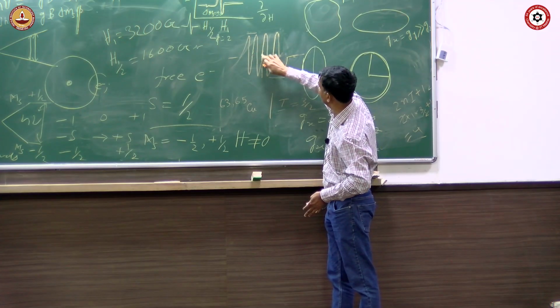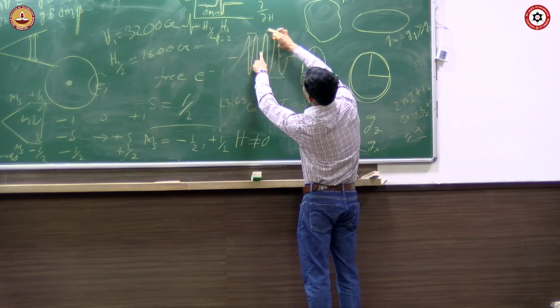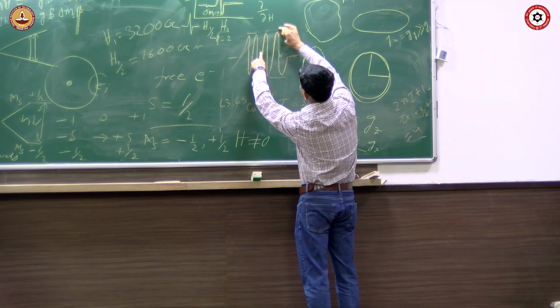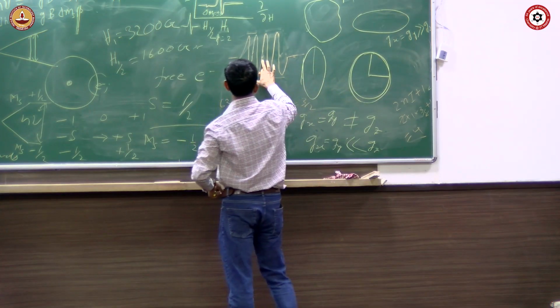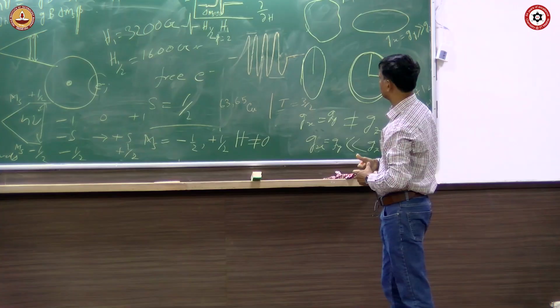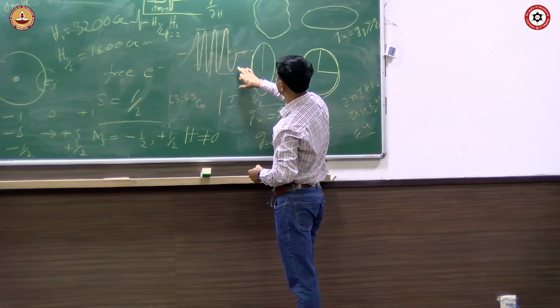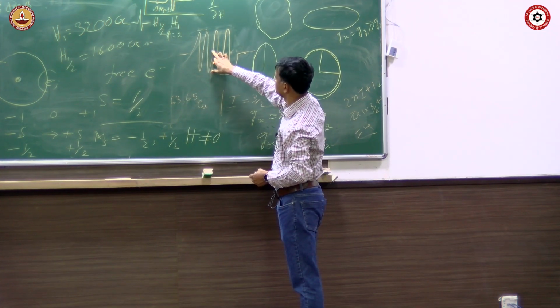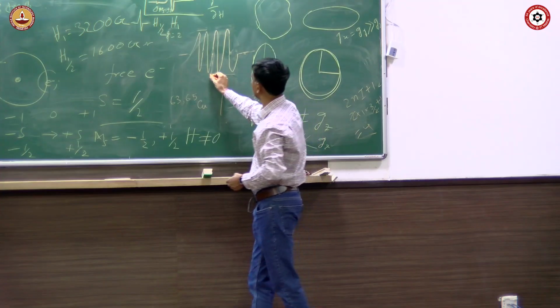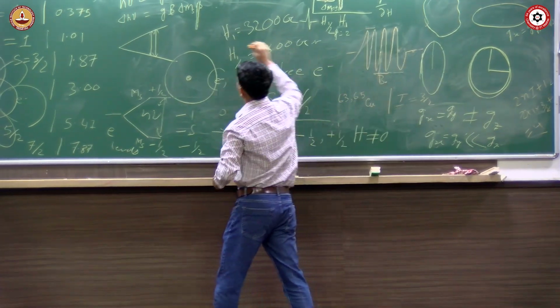So if you keep doing that, somewhere is the center. On this side you see 2 of them are here, 2 of them are here, and on this side 2 of them are here. So you try to see, or if I am wrong you can tell me, where could be the center. Here. So this is the one you have to take as the B0 for the calculation of your G value.